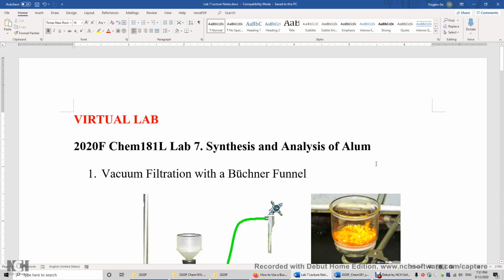This is my lecture on Lab 7, Synthesis and Analysis of Alum. This is a virtual lab. Experimental data will be given to you for you to write the lab report, as if you had done the experiments and collected those data. In this experiment, you will mix aluminum, potassium hydroxide, and sulfuric acid to make alum.